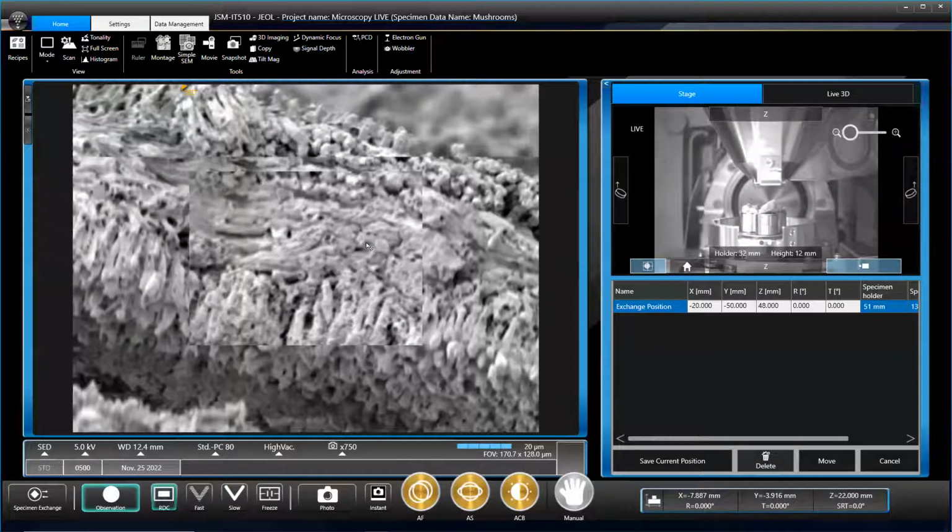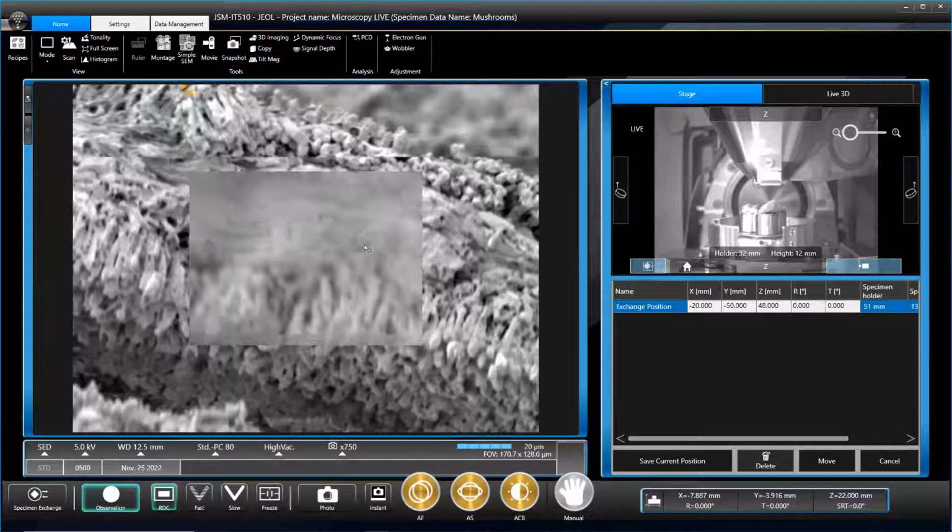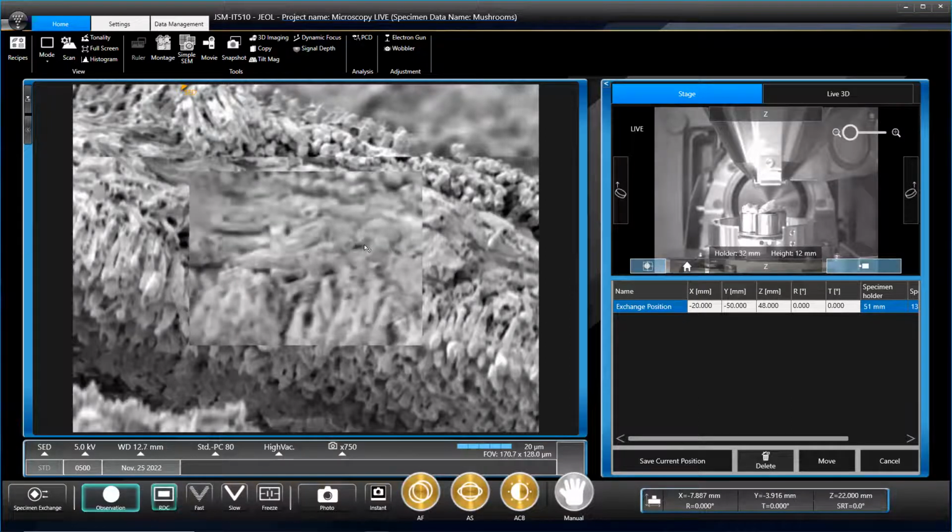As I'm doing this, there's a couple of different ways we can focus a microscope. You have the typical focus, which I'll just make big. You see it's out of focus. It's more in focus, it's still out of focus, so I've ruined it. But we can also change the shape of the beam slightly, so we can squish it in the X and Y direction. What we were looking at, we thought was a cross section. In theory, it's hard to tell because I'm doing a terrible job.